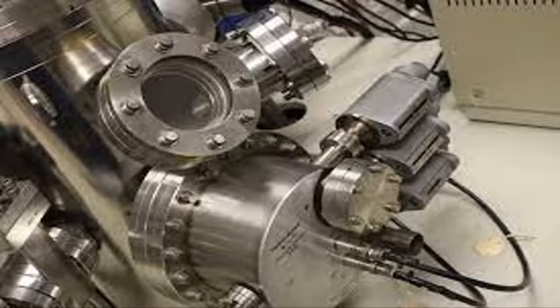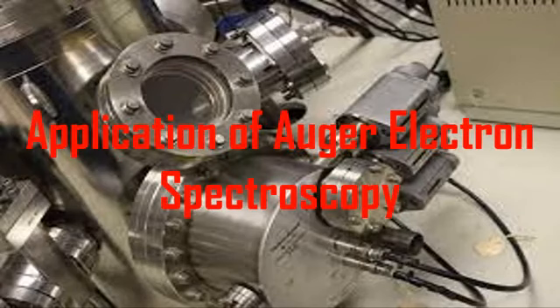Now let us briefly explain the different types of applications of Auger electron spectroscopy. So where is Auger electron spectroscopy used? First of all, in simple words, Auger electron spectroscopy is a core technique of the microelectronic industry. Usually in microelectronic industries, substrates with high purity are used.